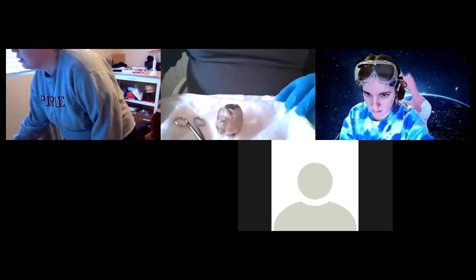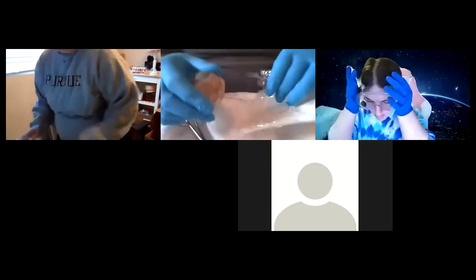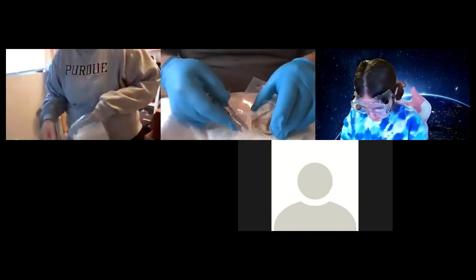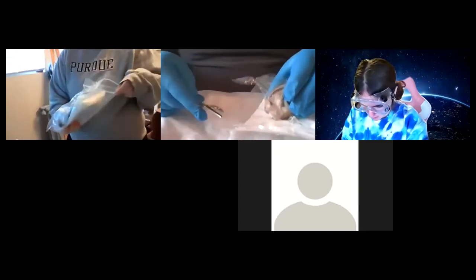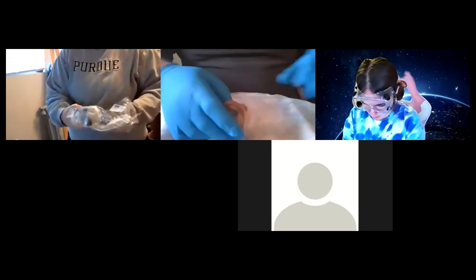For this dissection, you're definitely going to need your goggles. This comes out of the paper — basically just cut it out with a scissor. It's okay if you dig into the tissue a little bit; use the blunt end of the scissor to cut this out of the plastic. It's pretty tightly wound up in there.